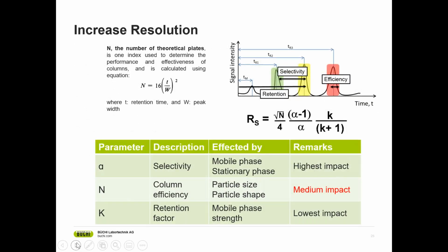Now we can talk about the medium impact factor to improve your separations. Efficiency, which is highly dependent on the particle size and geometry of the stationary phase employed.